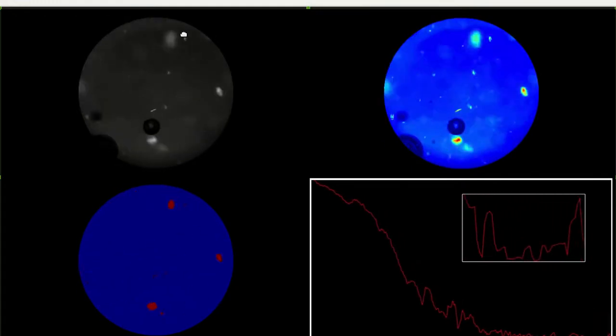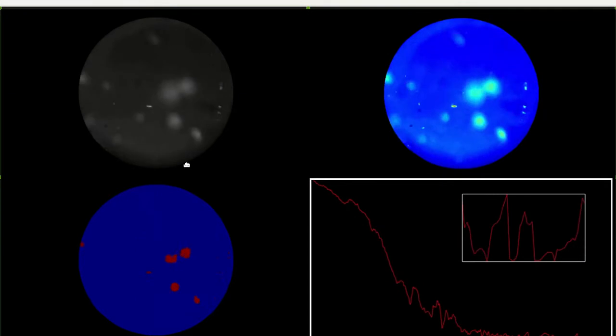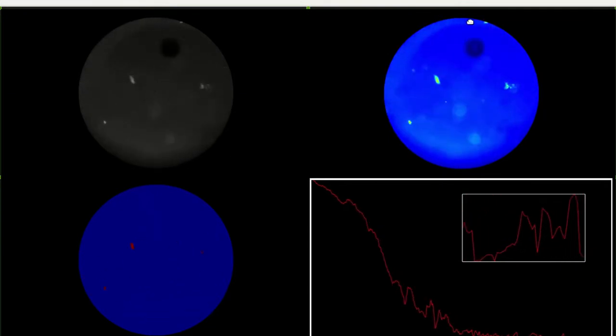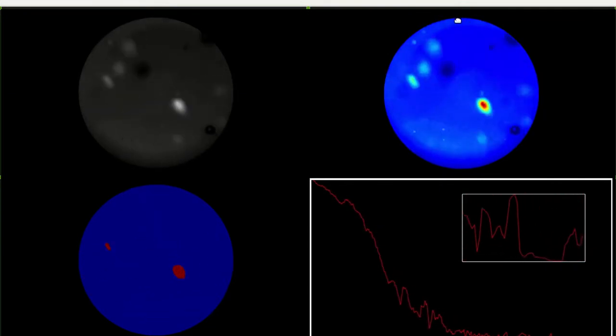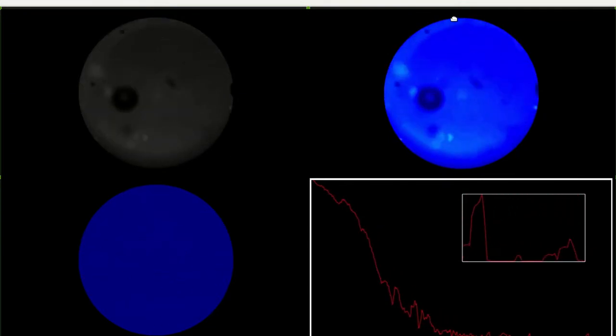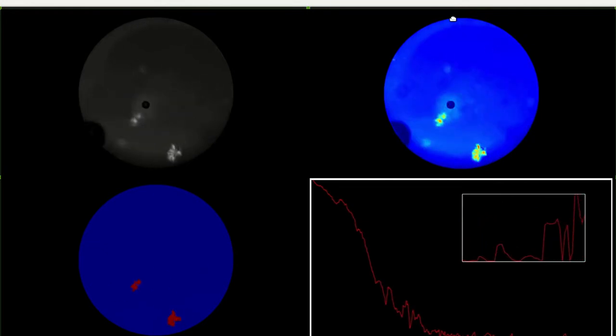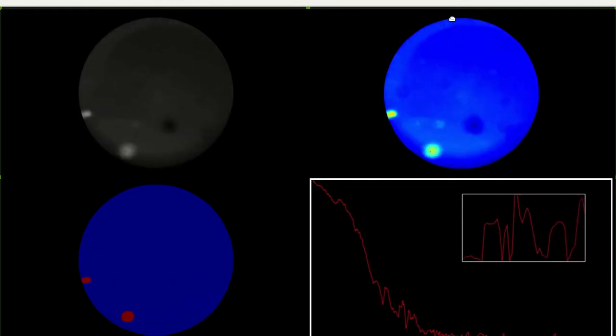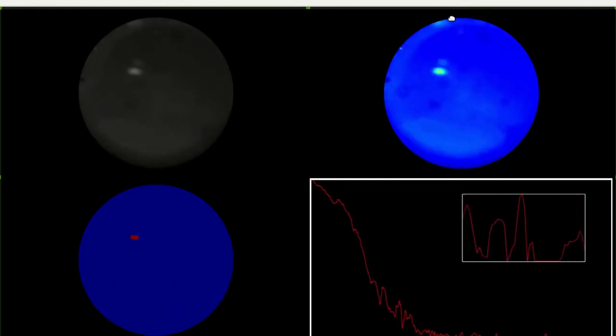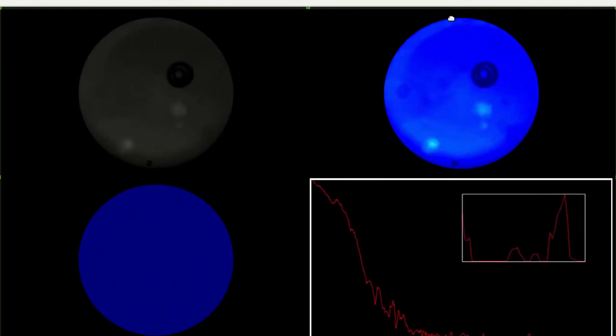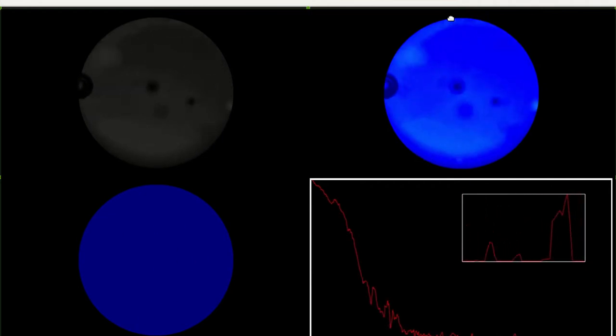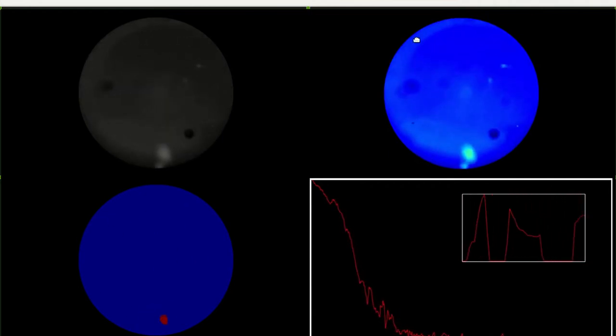In the upper left is raw video recorded by the Oculus. In the upper right is a contour plot of the intensities. Bright red or yellow spots correspond to bright spots from the original Oculus image whereas blue and black represent dark spots.